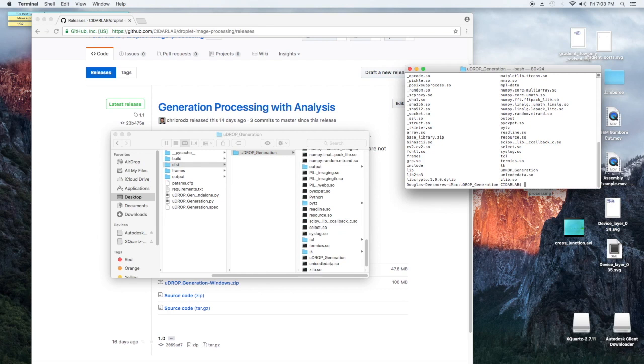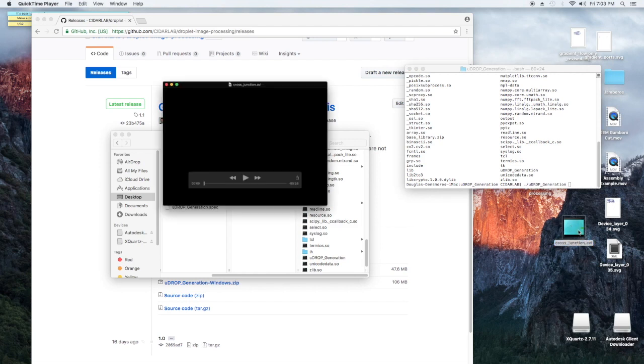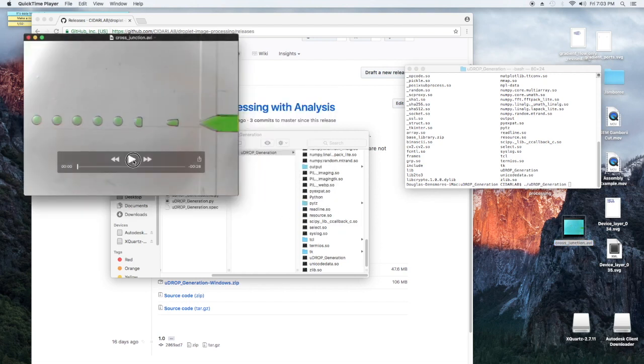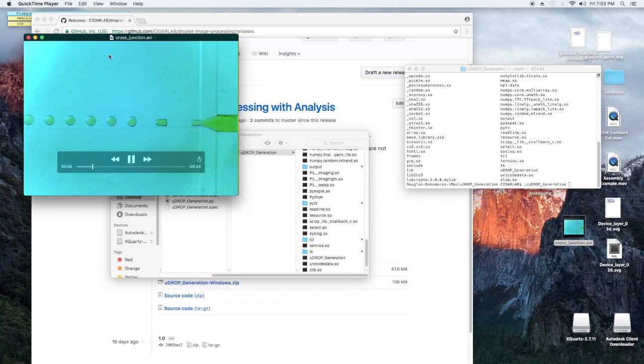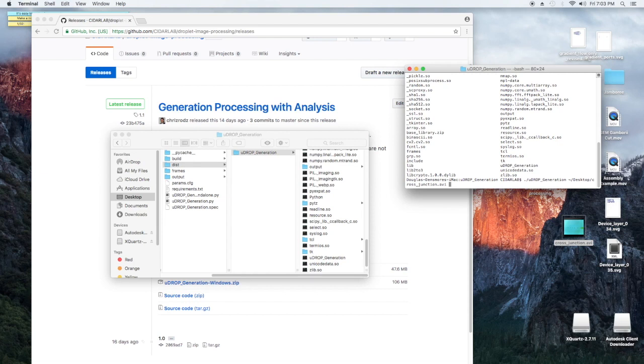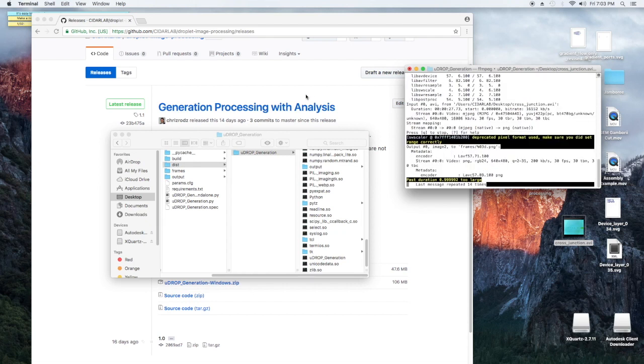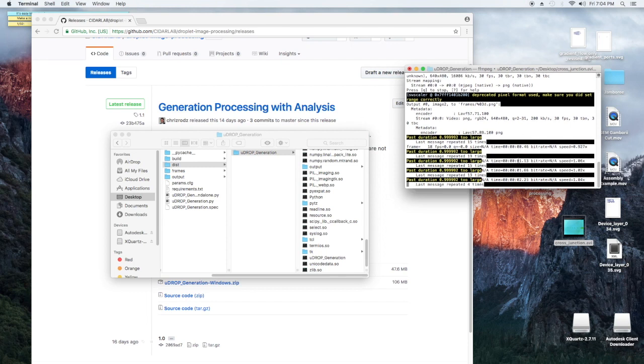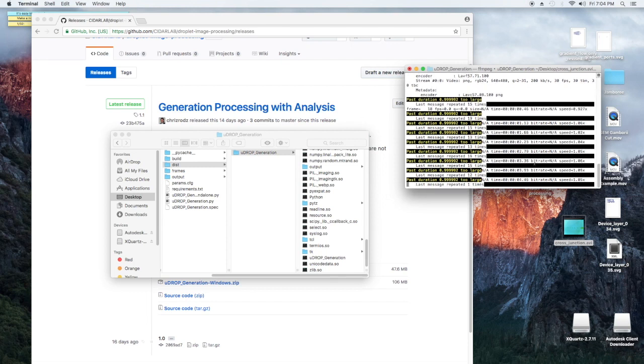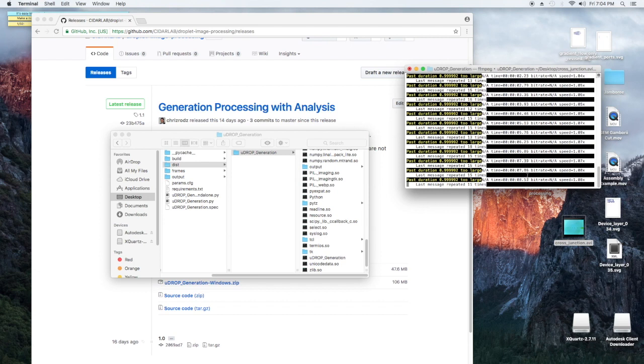So we're going to run this by just getting the name of the executable, and again if you're on Windows this is going to be the .exe file, and we're going to give it the location of one of our Droplet Generation videos. So I have on my desktop a short little video of Droplet Generation that you can see right here, so we're going to analyze this one. That's going to be on my desktop, so tilde slash desktop cross-junction.avi. So we're going to run that, and then ffmpeg is going to split it into its frames.